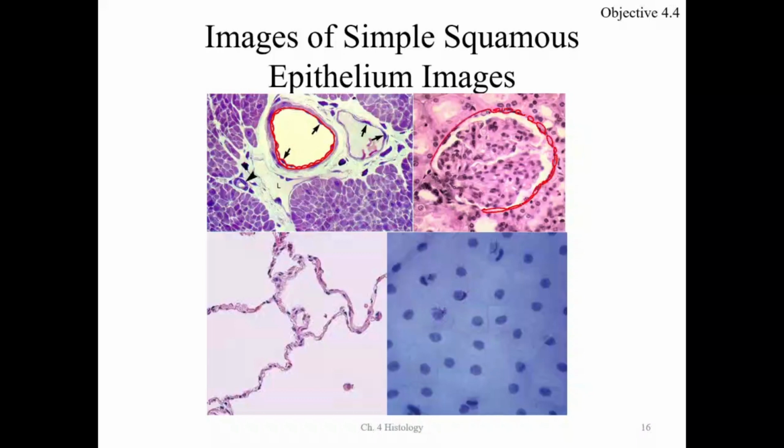All this right here, these are all squamous epithelium. So the squish squash, simple squamous, one layer. Now this is one layer here of squamous epithelium, top and bottom. These are in the lungs. So right here you can see a free surface. That's air right here. This is the lung pockets, the alveoli of the lungs.